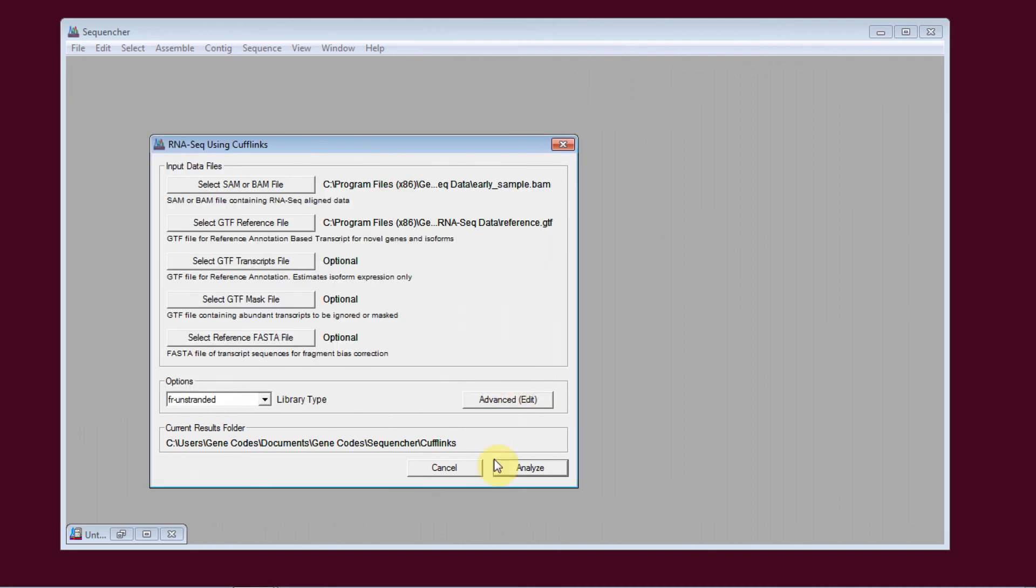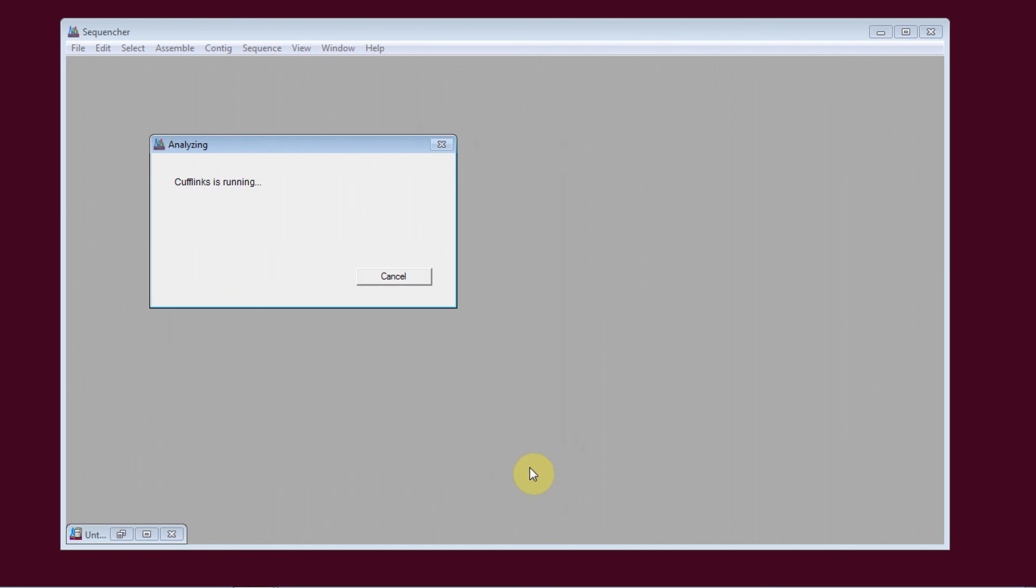We'll go ahead and click Analyze. Since we're looking at differential expression, we'll need to repeat this step for the corresponding set of late reads as well.